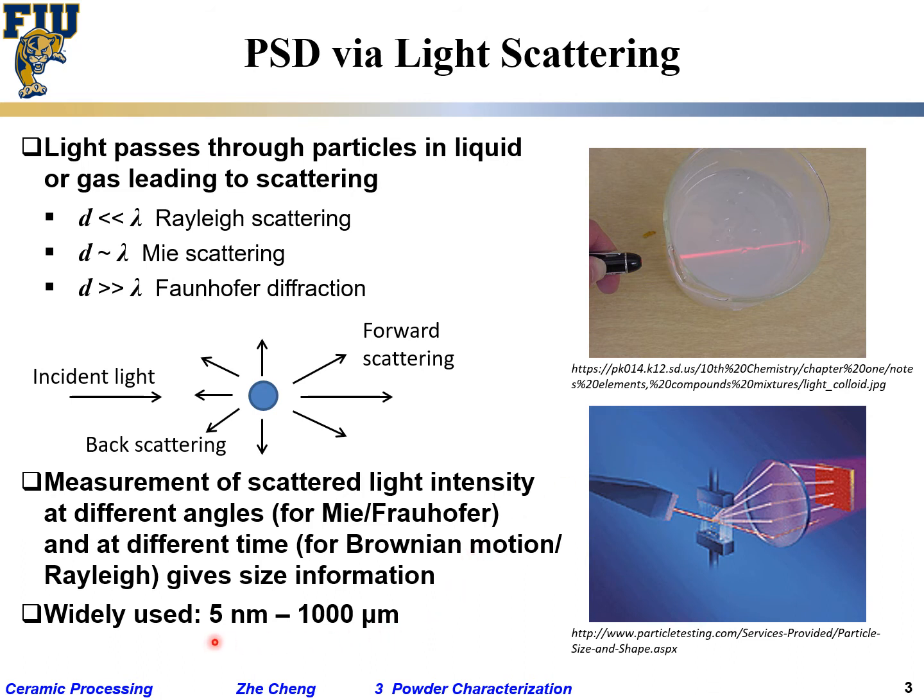This is widely used for particles ranging from 5 nanometers, very, very fine, to thousands of microns. Quite often nowadays the analysis is automatic.